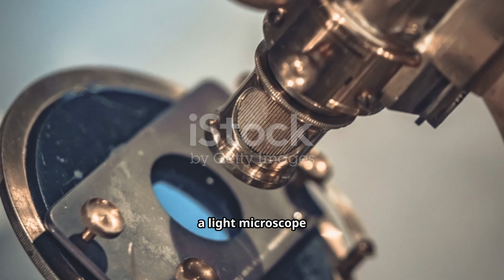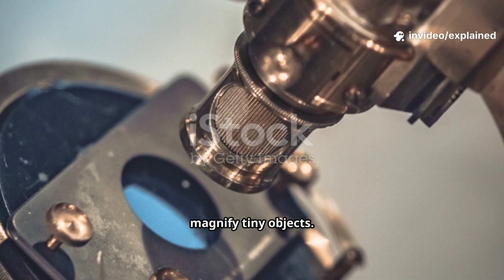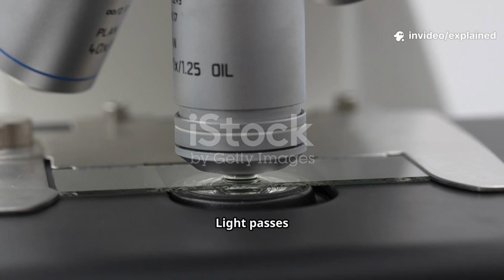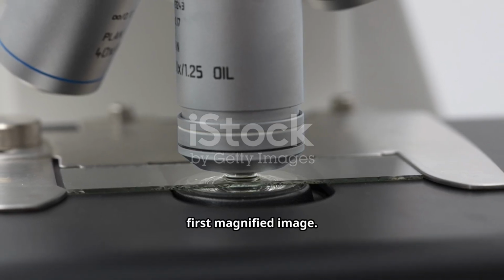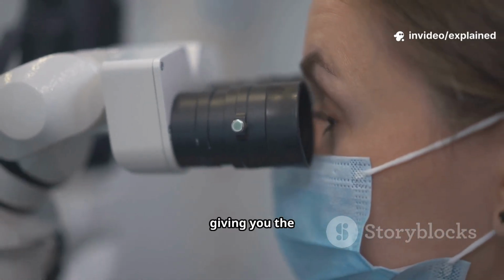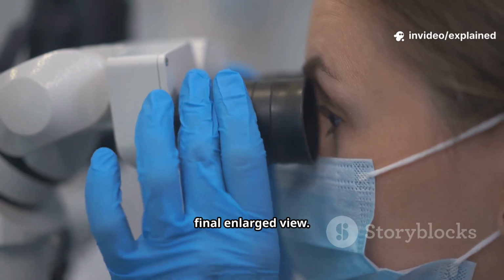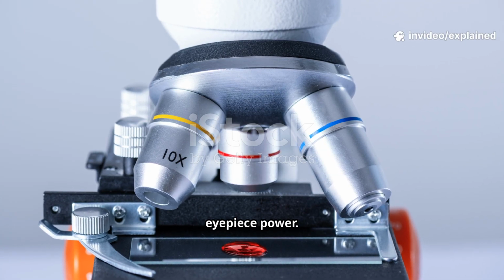At its core, a light microscope uses a simple but brilliant principle: bending light to magnify tiny objects. Light passes through your specimen and enters the objective lens, which creates the first magnified image. This image is then further magnified by the eyepiece lens, giving you the final enlarged view. Total magnification equals the objective lens power times the eyepiece power.